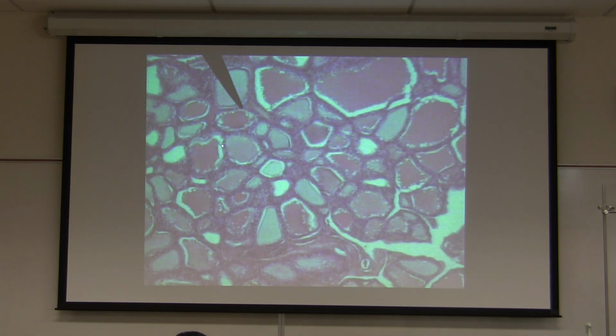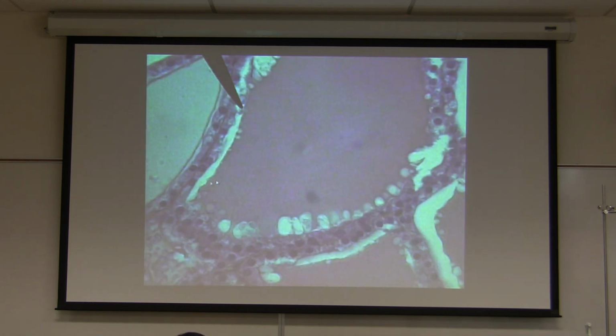What organ? Thyroid gland. What system? Endocrine system. You cannot write down digestive, you cannot write down reproductive, none of that is acceptable. Okay, what is the name of the molecule here? Thyroglobulin. Very good. What tissue? Simple cuboidal epithelial tissue. That's the one I want. What is the name of the cell? Very good. Follicular cells.